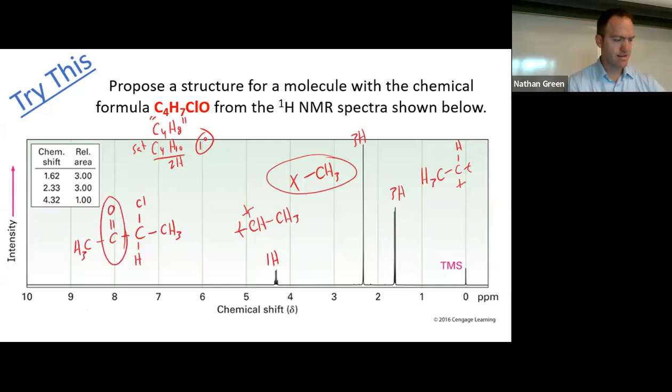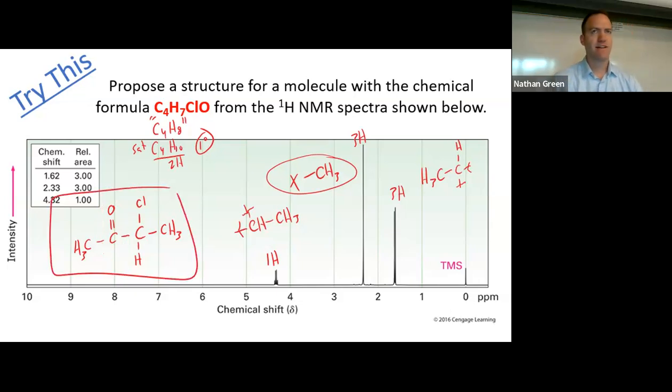I can't see anything in that circle. None of that shows up on my NMR because there's no protons present, but I assume they're there to make sense of the spectrum that I see. And that's why I think NMR is hard, because you're having to bring in pieces that you can't see. You're looking at shadows on a wall and you're assuming things about the world that's happening outside of you from very limited information. Anybody get that? I think this is the toughest one I've given you.